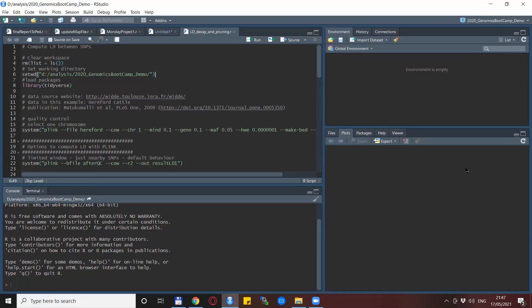Hello everyone, welcome back to the Genomics Bootcamp. This time we will show some practical applications and computations of linkage disequilibrium using Plink. Here we have a neat script put together using Plink and R together and also doing some visualizations in the meantime.